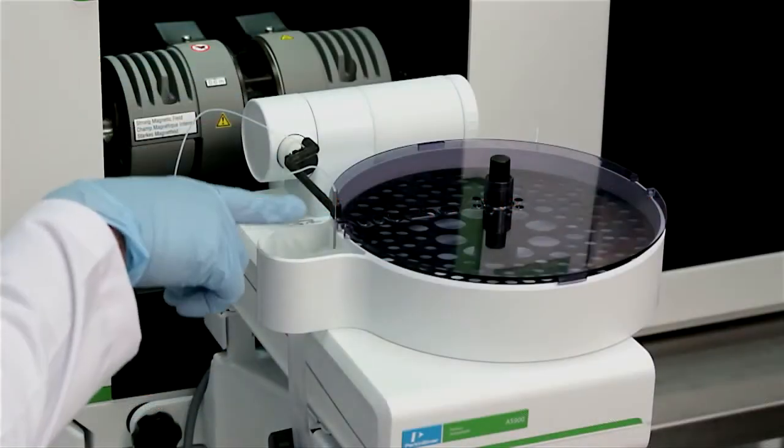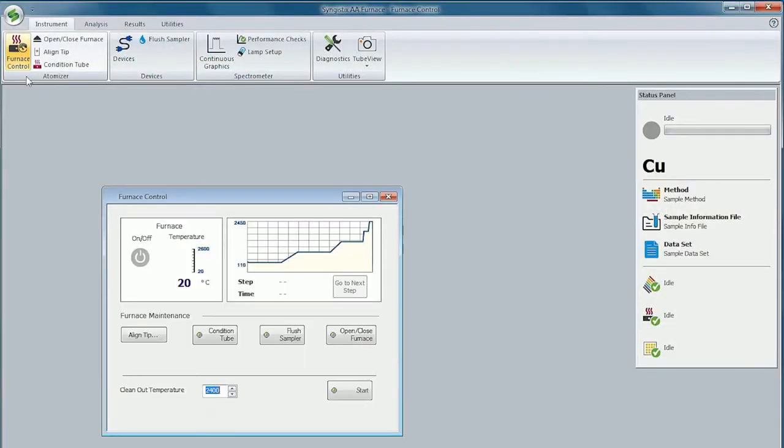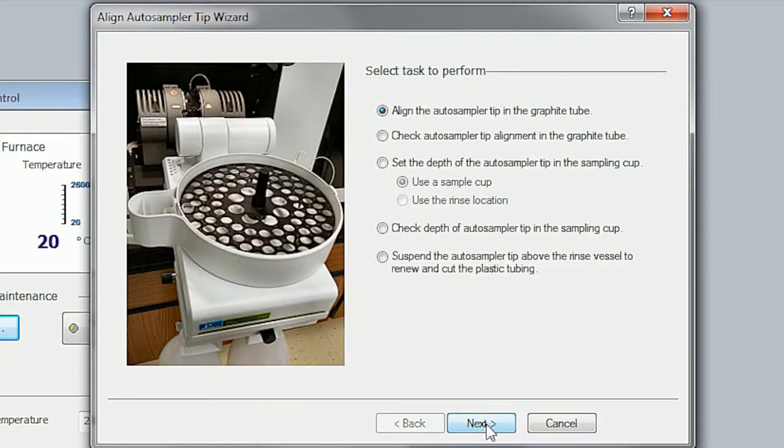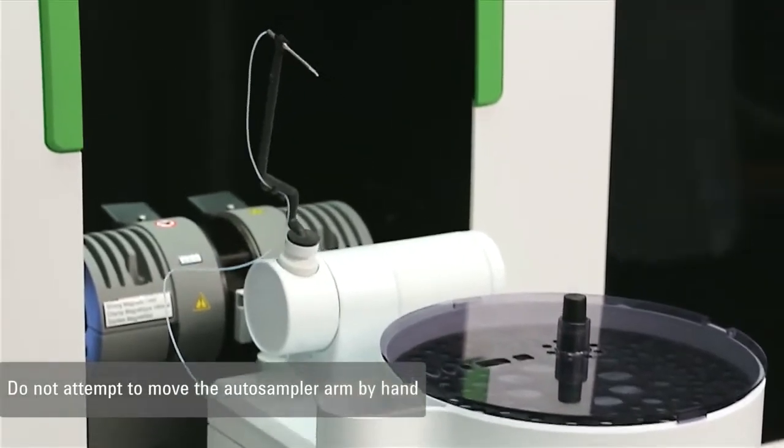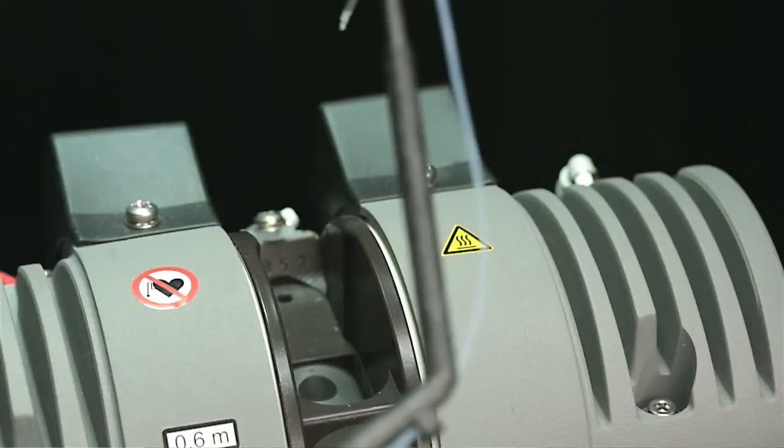This procedure checks that the auto sampler tip is aligned with the injection hole. Click align tip in the furnace control window to bring up the align auto sampler tip wizard, then select align the auto sampler tip in the graphite tube. The auto sampler arm is unlocked and the pipette tip is moved directly above the graphite tube.